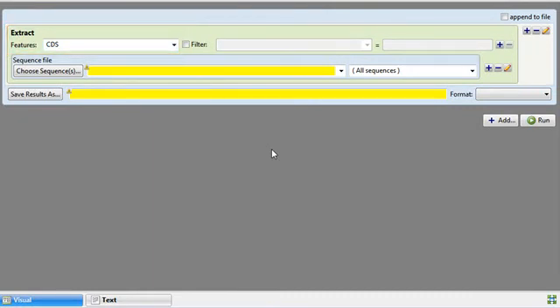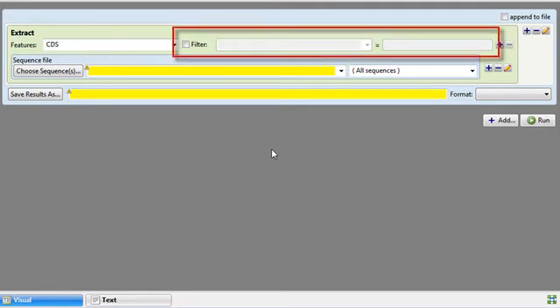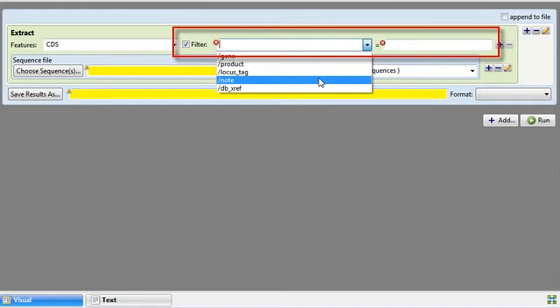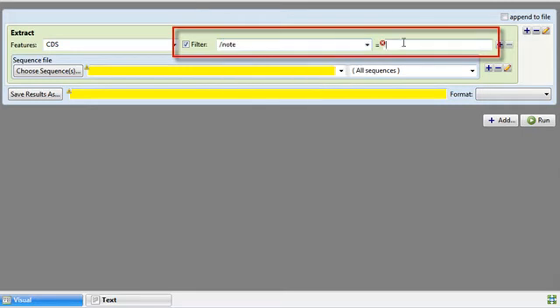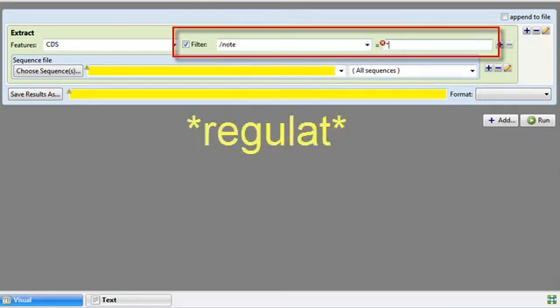Since I want to filter for regulatory genes only, I need to check the filter box. In the drop-down menu, I'll select Note, and on the right I'll type in my search term.